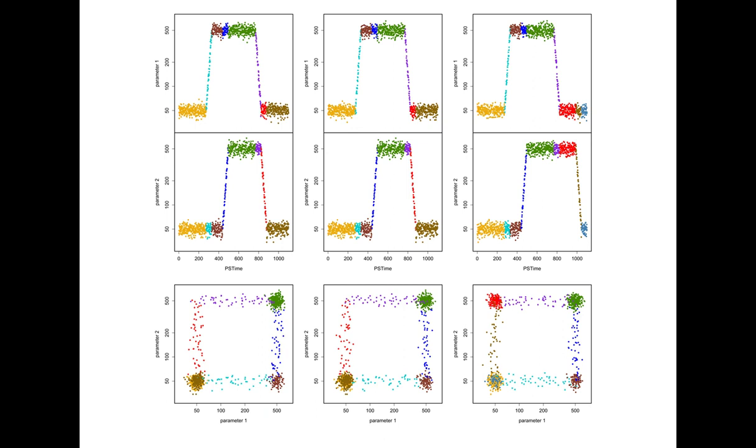Therefore, the transitional cyan cells move, in quotes, to the right in the parameter 1 direction and remain fixed in the parameter 2 direction in the bottom of the histogram. If the expression of one parameter is shifted in time relative to the other parameter, the number of cells populating clusters and transitions is affected, middle and right columns.